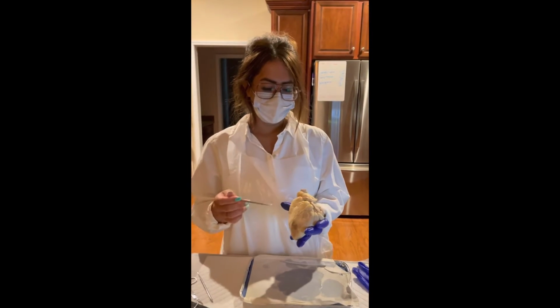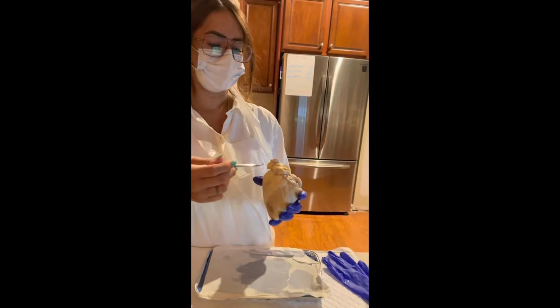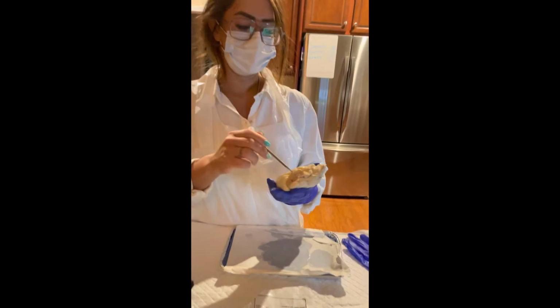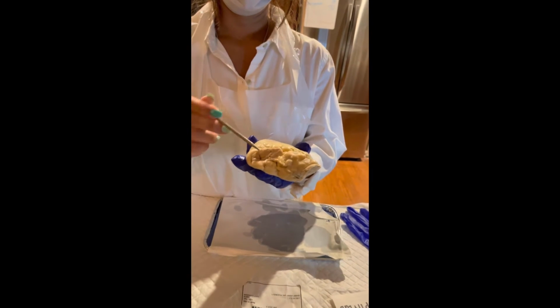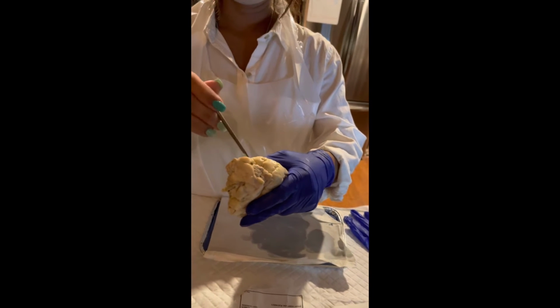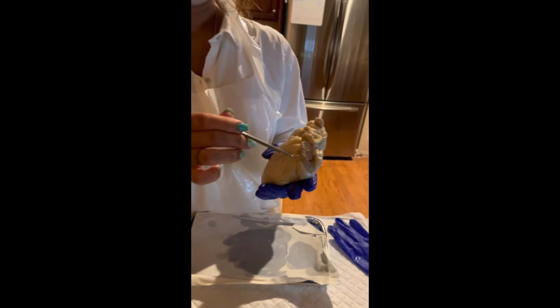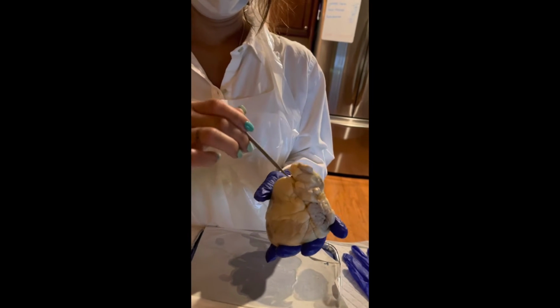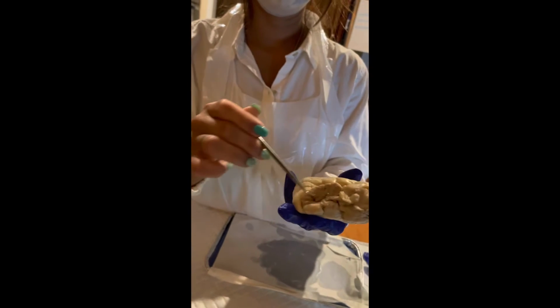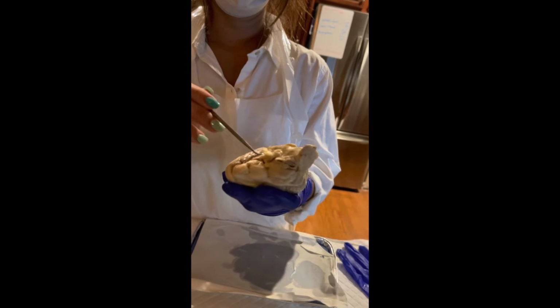Now positioning our sheep's heart kind of facing toward me, and just for a better view on the camera's end, I'm going to show you 2 auricles. So here is our right auricle and left auricle. Also, this would be considered the right atrium and the left atrium on this side as well, in the same region as those auricles that fill up for the atrium.